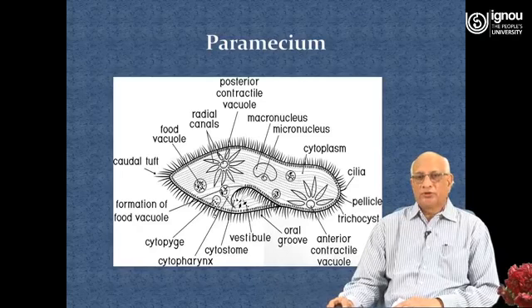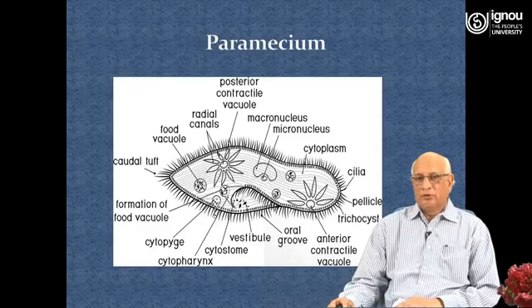Now, two important structures are there, known as contractile vacuoles. These vacuoles are for osmoregulation. Due to osmosis, as the protoplasm is dense in comparison to the outer water, water and various salts enter the body from outside, and this may disturb the concentration of the protoplasm. Then it is necessary that this water be thrown outside the body of the animal. So the contractile vacuoles work.